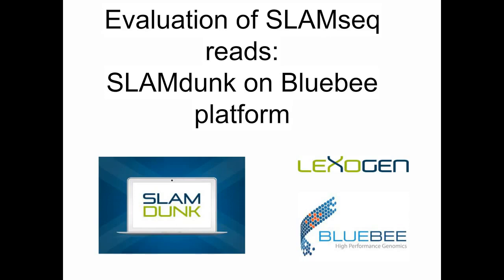But in principle, the SLAM-seq method itself is for a preparation of total RNA ready for RNA-seq library prep. So in case you were looking at non-polyadenylated transcripts or wanted to have resolution of isoforms and sequence other parts of the mRNA transcripts, then it is possible to use the SLAM-seq generated total RNA for other library prep methods.